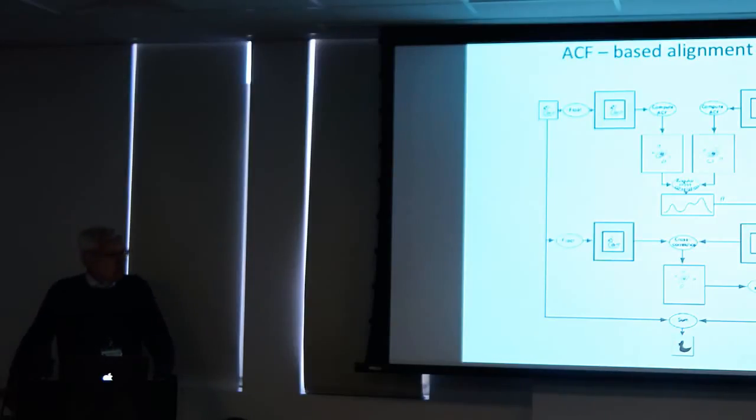No, I think that's the right way to do it. 100 kV should make instruments more affordable. I don't know how much more affordable, but they even talk about democratization of instruments. But I think even though the imaging conditions might not be ideal, nowadays, with the powerful cameras, we still have leeway to get to virtually the same kind of performance. I think it's a good way to go.